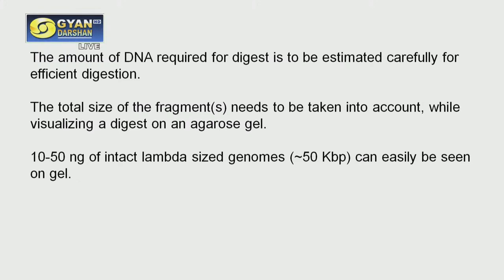Of course, you know that the plasmid has a multiple cloning site where there are several restriction enzyme sites. So you can choose any of these enzymes to cut the plasmid DNA. When you cut the plasmid DNA, you can use one enzyme or you can use two enzymes also. If you want to cut the plasmid DNA with two enzymes, let's say BamHI and EcoRI. Or if you want to digest the plasmid with one single enzyme, maybe EcoRI or HindIII or BamHI, whatever.